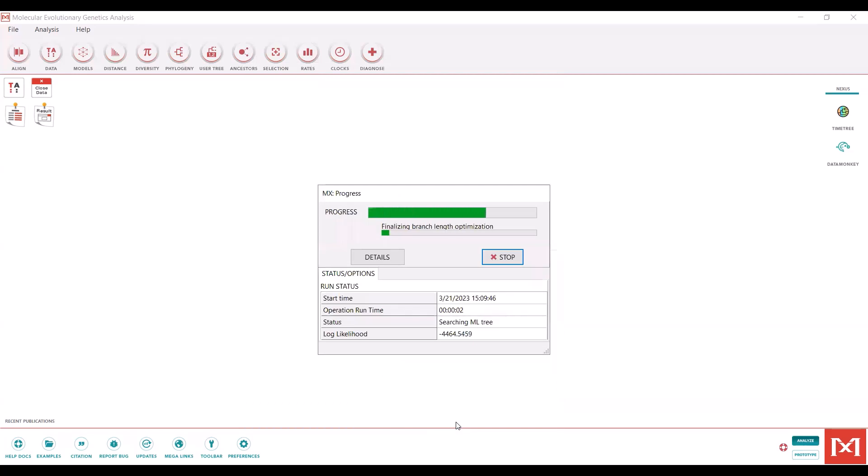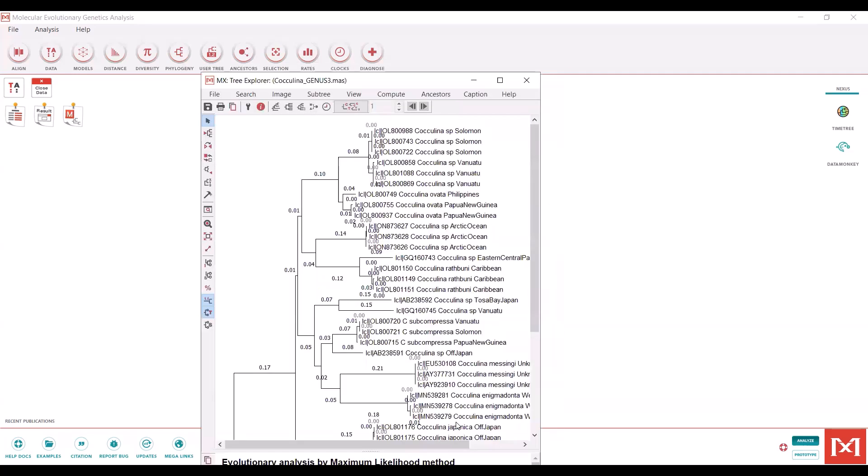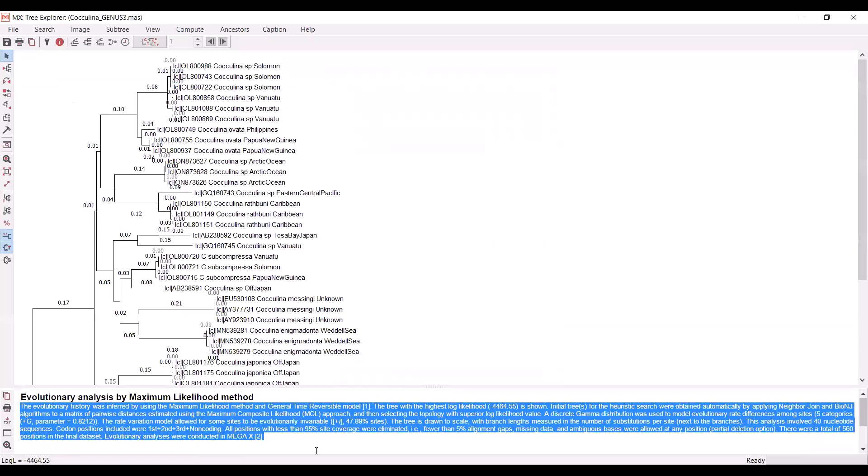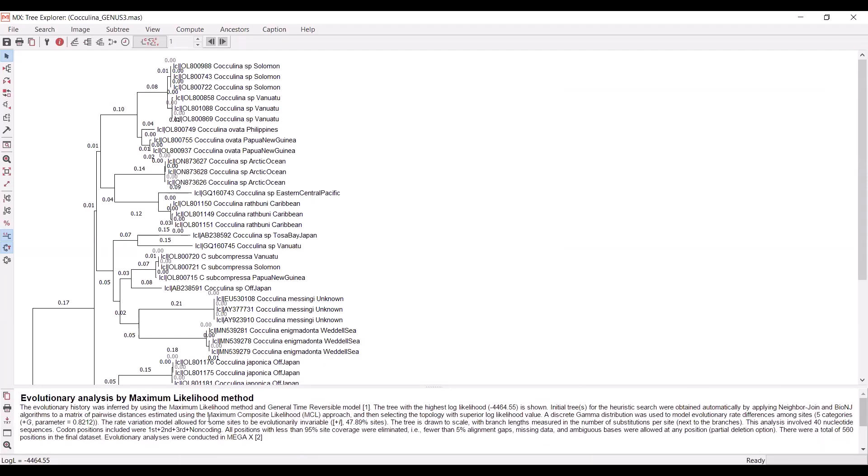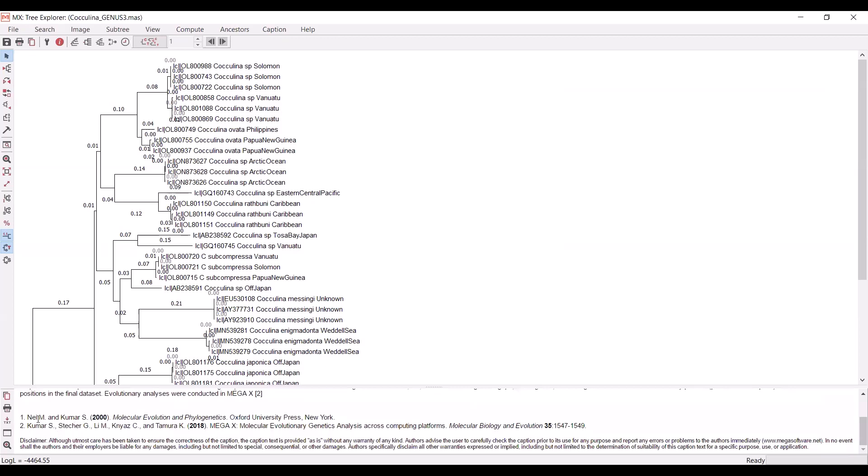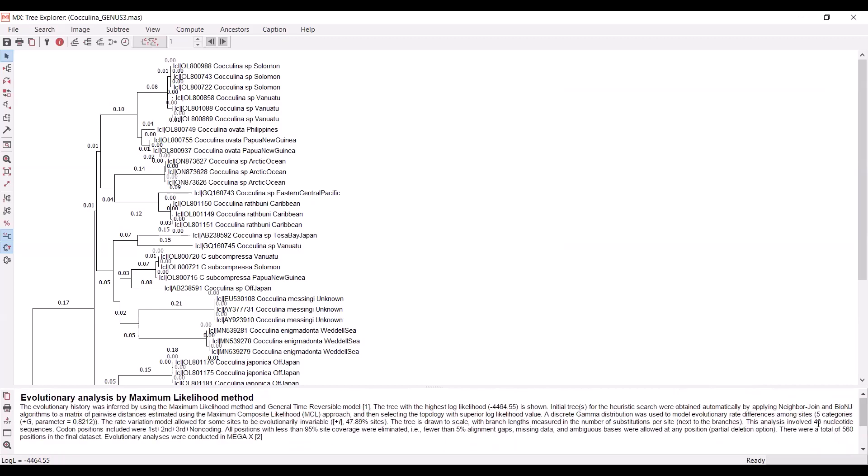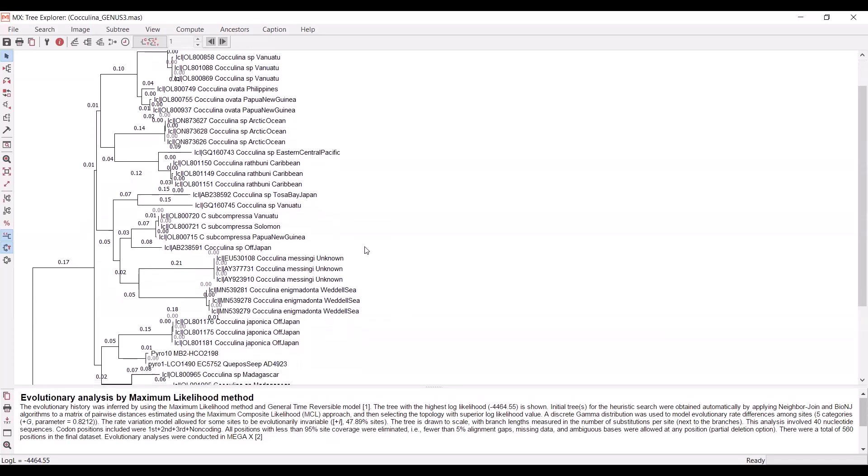It is going to very quickly produce a maximum likelihood tree for you. One thing that's great about this program is that it actually produces captions for you. This is free to use. They just ask that you cite the authors of the program. This involved 40 nucleotide sequences. Of particular importance, it tells you how many positions are in the final dataset after filtering for that 95% coverage threshold. This is really important to pay attention to because if you are expecting a lot more base positions to be incorporated into your phylogeny, you may want to adjust the partial deletion parameter to account for that.